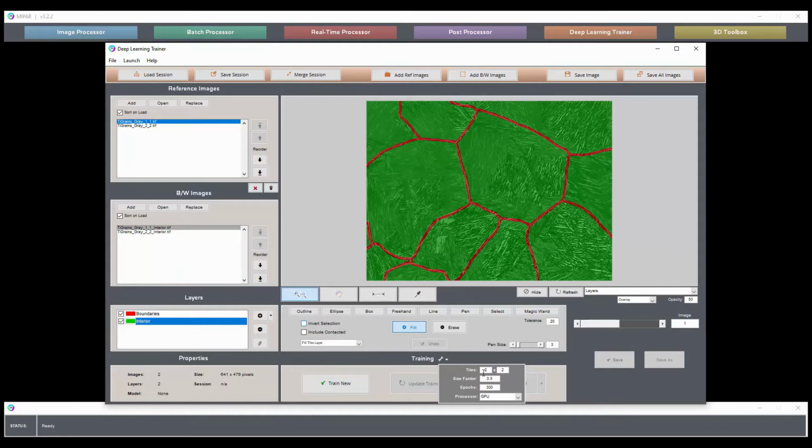Here, I won't touch too long on the settings. They're described in the user manual. Basically, the first one here, tiles, allows us to split up an image into several subfields. We found this not only reduces the memory demand while training, but produces better results, since deep learning training tends to be fairly image hungry, although we've gotten great results even with just 3 to 5 images sometimes.